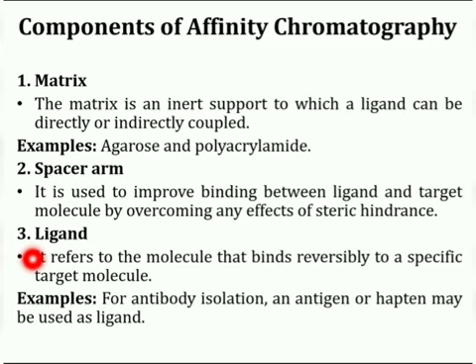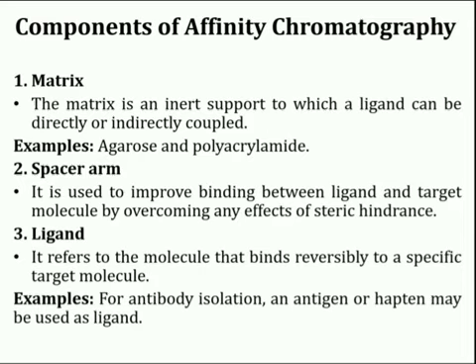Third component of affinity chromatography is ligand. Ligand is a molecule that binds reversibly to a specific target molecule. Criteria for the selection of the ligand is the nature of the macromolecule to be isolated. For example, when a hormone receptor protein is to be purified by affinity chromatography, the hormone itself is an ideal candidate for the ligand. For antibody isolation, an antigen or hapten may be used as ligand.